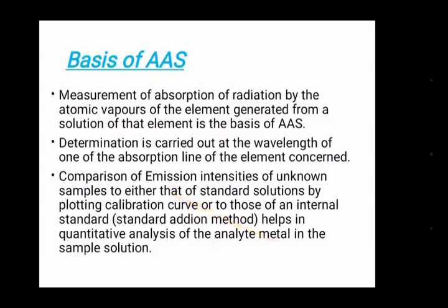Now what's the basis of AAS? Measurement of absorption of radiation by the atomic vapor of an element generated from a solution of that element is the basis of AAS. Determination is carried out at a wavelength of one of the absorption lines of the element concerned.